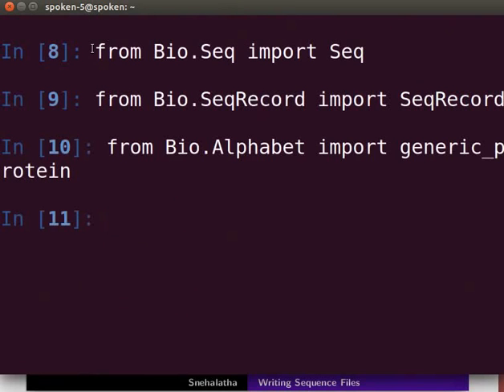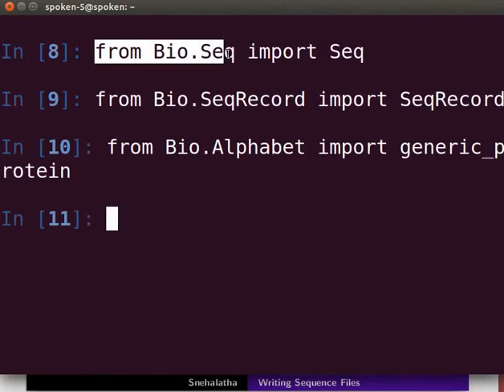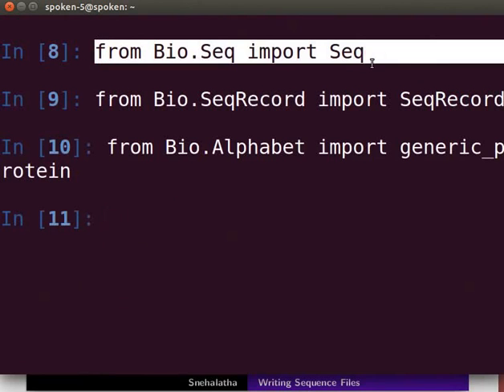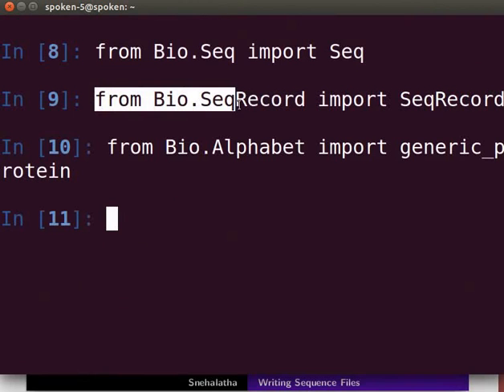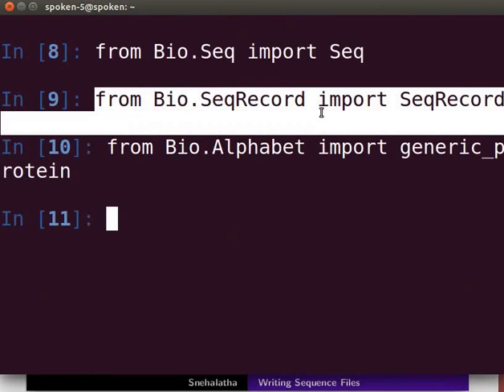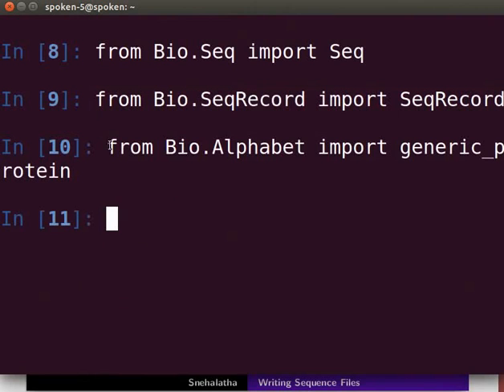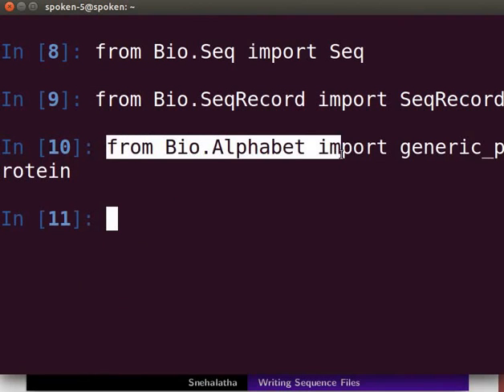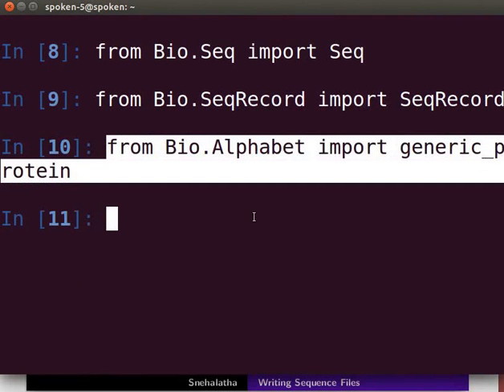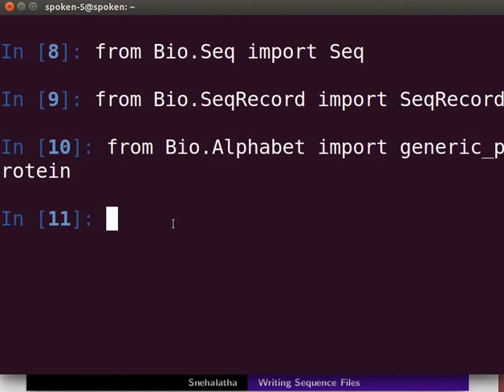From the Bio.Seq module, import the Seq class. Next, from the Bio.SeqRecord module, import the SeqRecord class. Next, from the Bio.Alphabet module, import the generic_protein class.